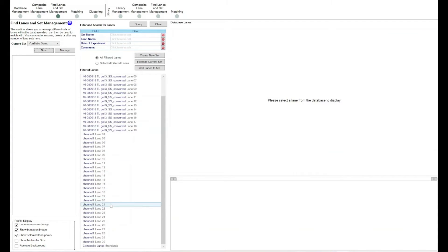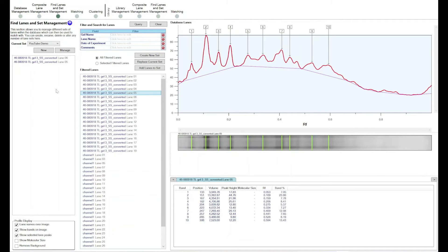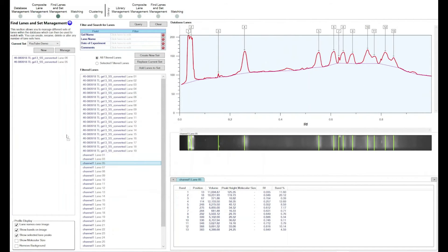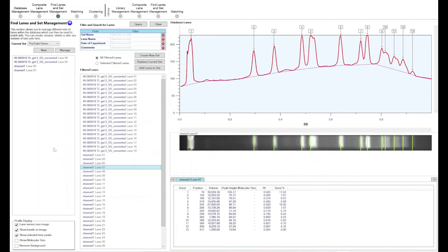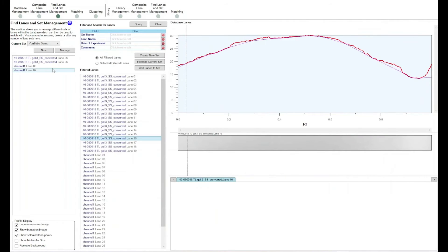Once you have the lanes in the center that you want to compare, say I want to compare lanes five and six from one converted image to lanes five and seven on another image. What I would do is simply left-click and drag those across — lanes five and six, then five and seven — dragging them into the left-hand side to build up this set. Now I've got these four lanes to compare against each other.